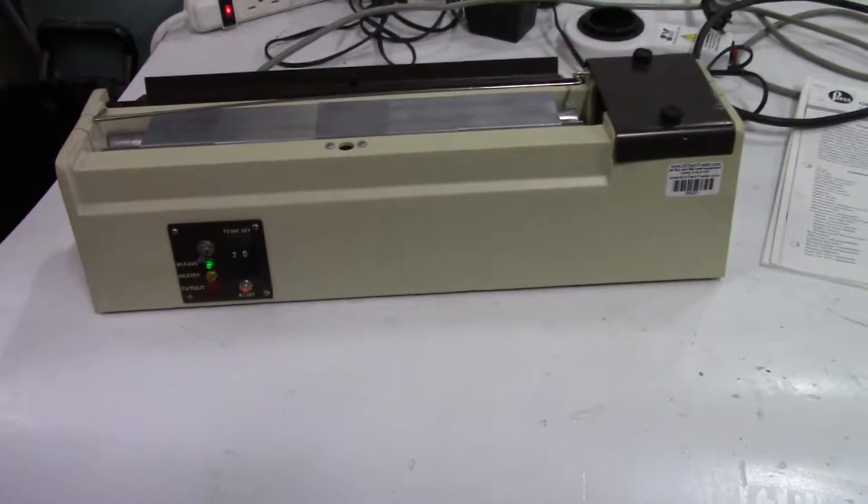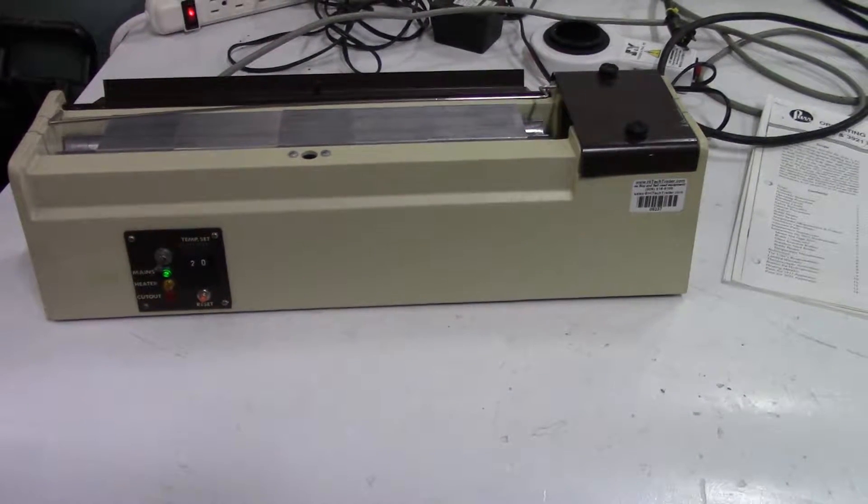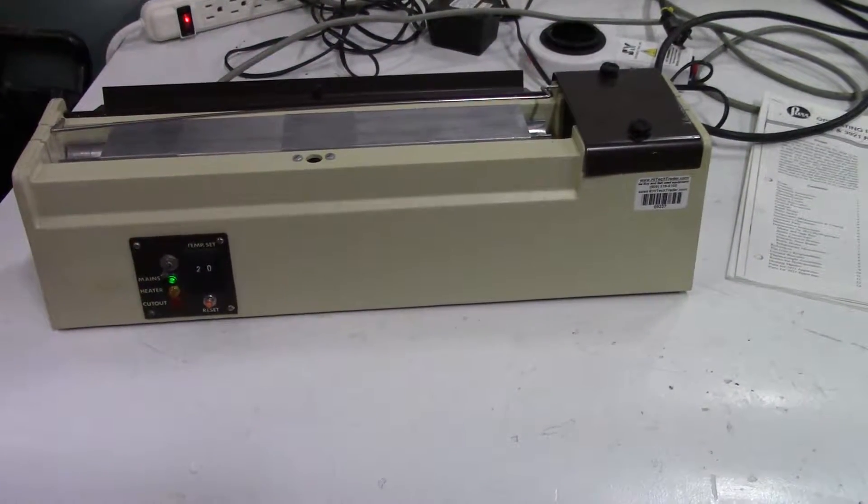Hi, this is Michael from Hi-Tech Trader. Today we're looking at a Jones Chromatography column heater.